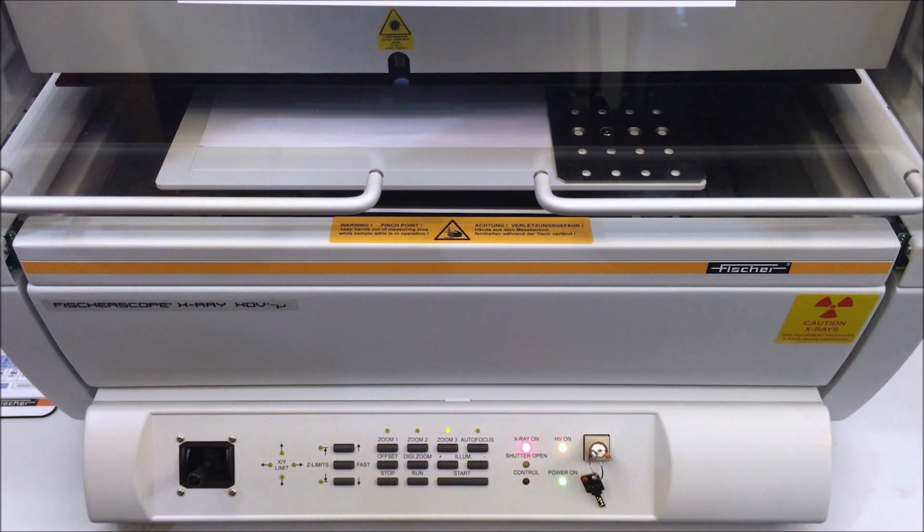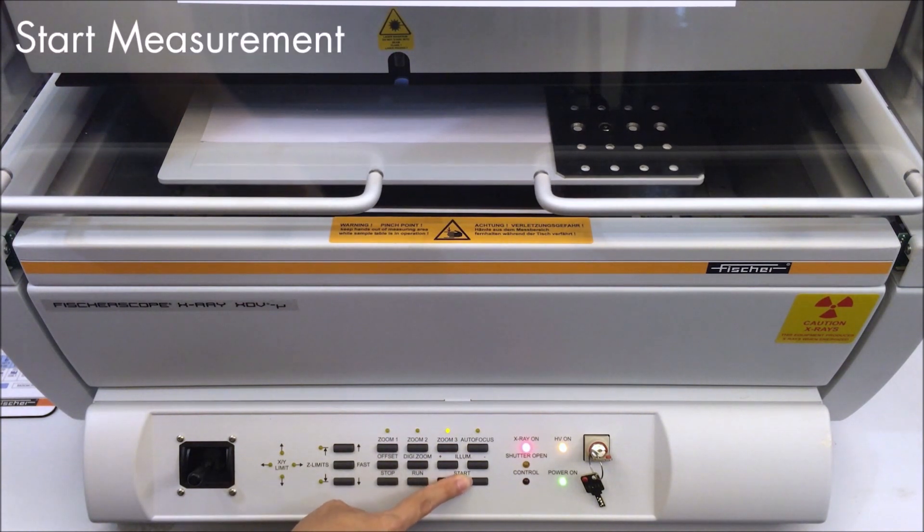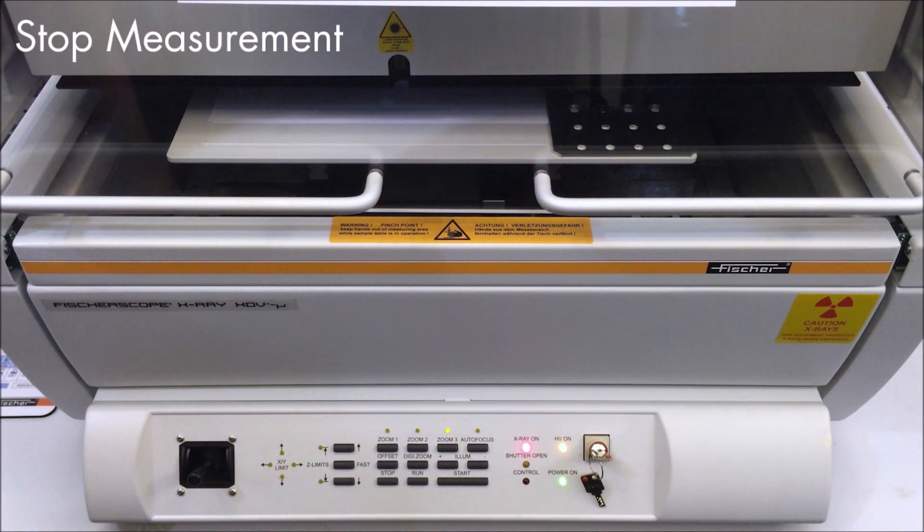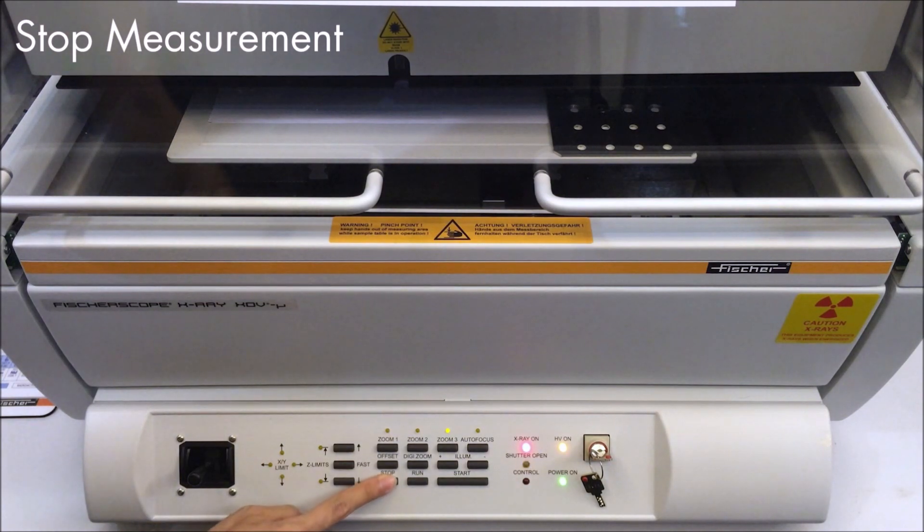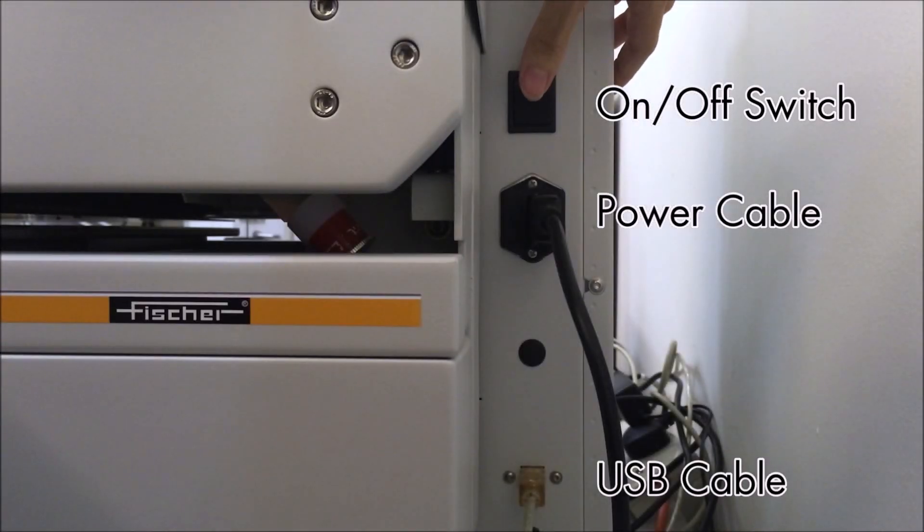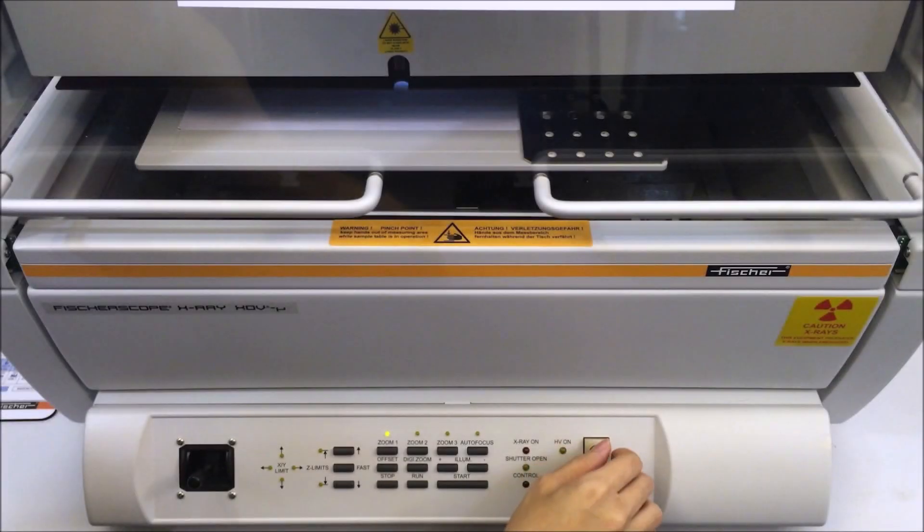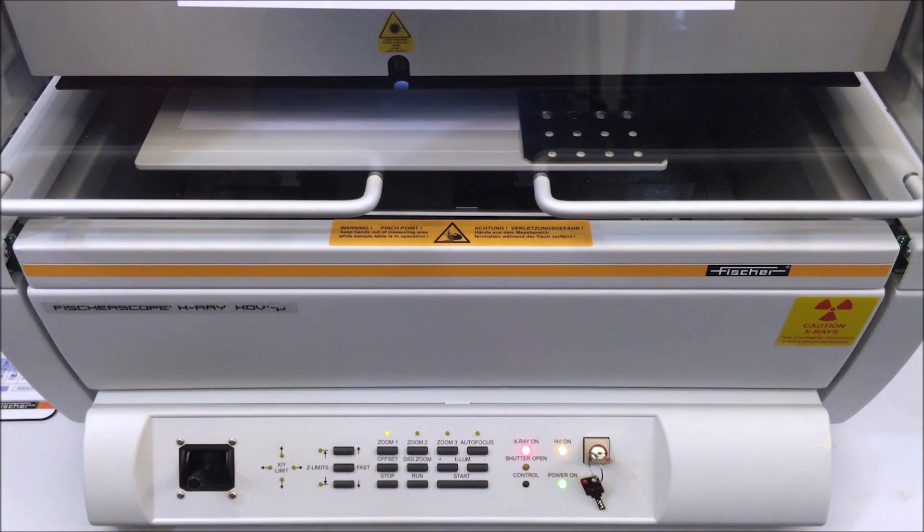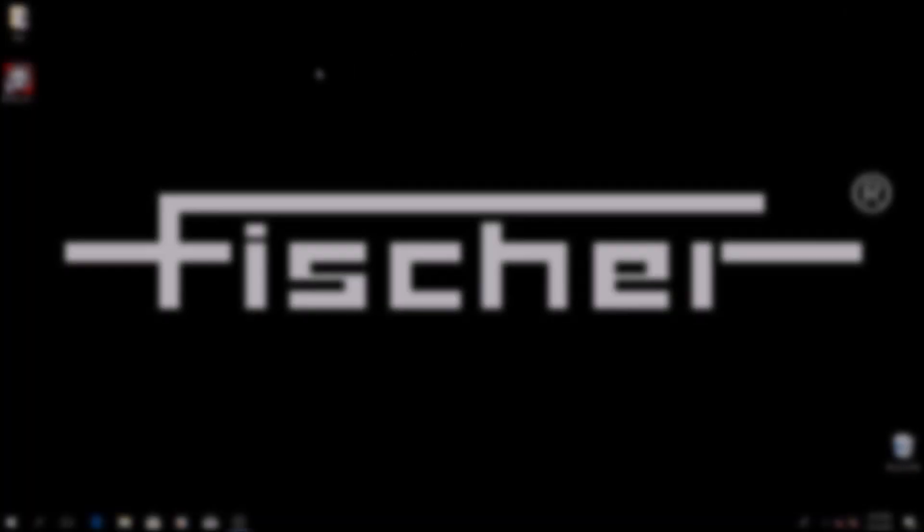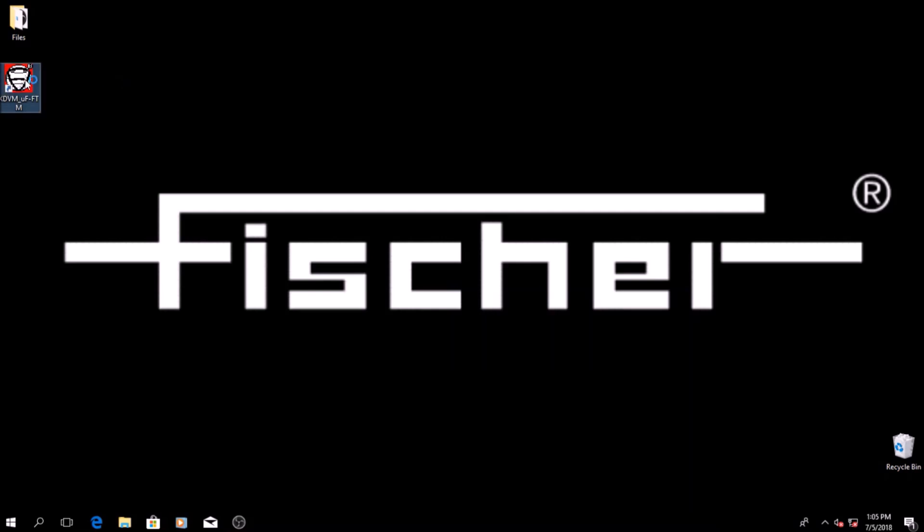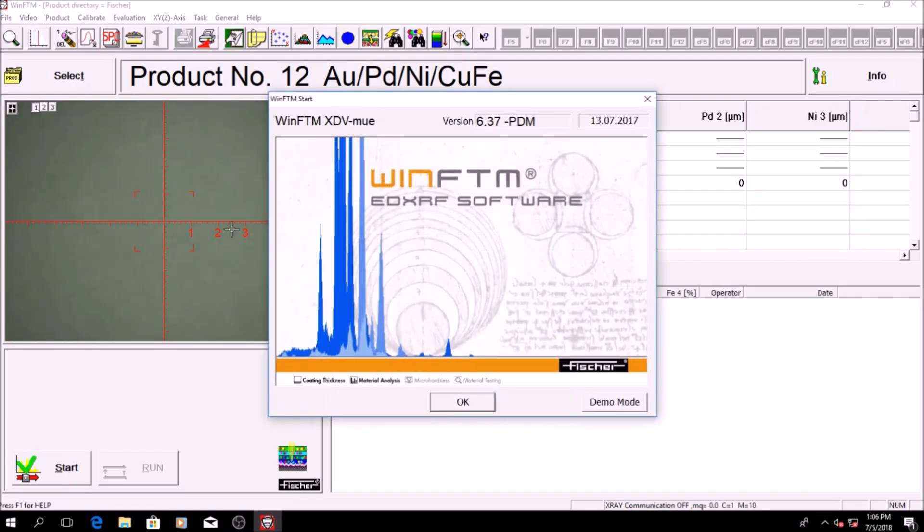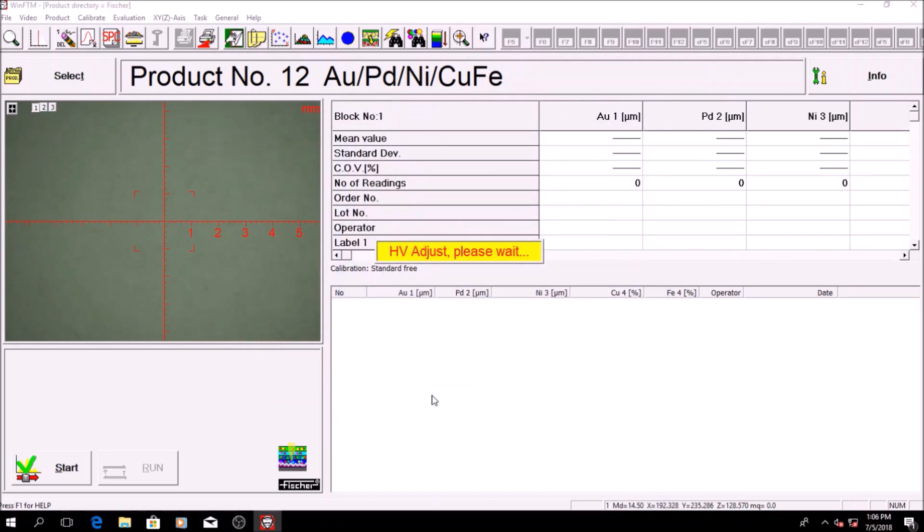Each instrument comes factory calibrated and ready to use as delivered. First, turn on the computer, switch on the instrument by using the main switch on the right. Turn the key to the right to turn on the high voltage x-ray energy. Connect the XDV Mule cable via USB and click on the WinFTM for the XDV Mule. The software will be started and the communication between the instrument and the software will be initialized.